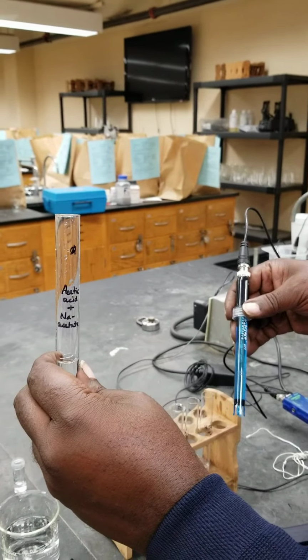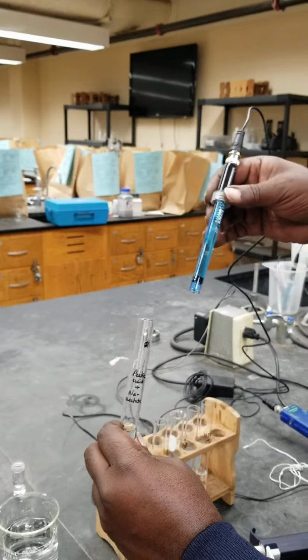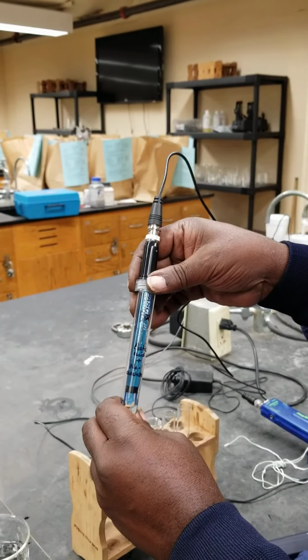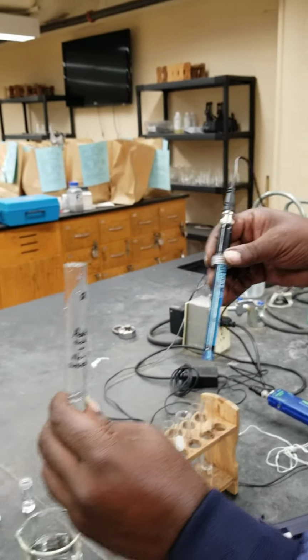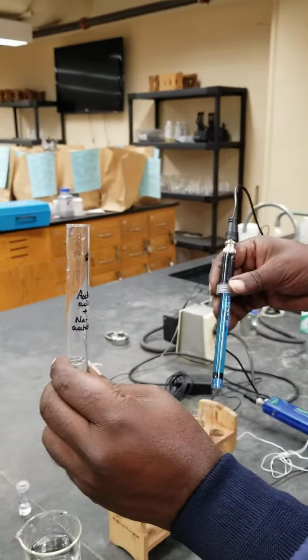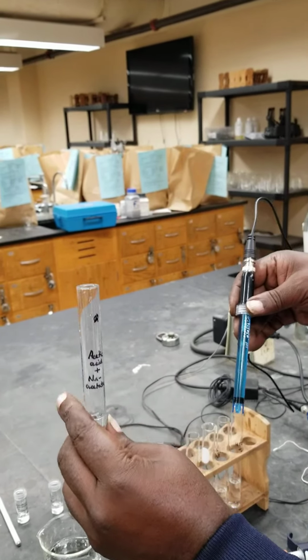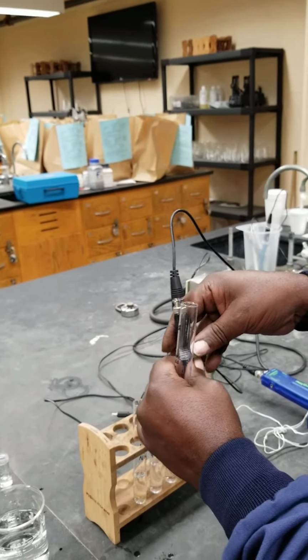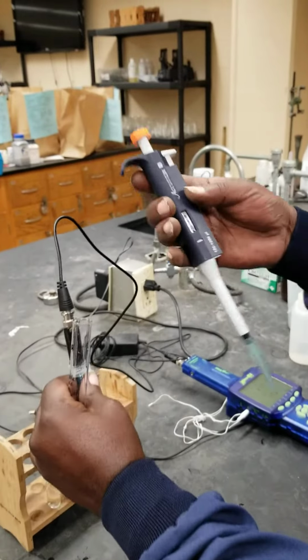And I added about 3 milliliters of water. The volume of water doesn't really matter. The idea is that when I add the base, the electrode should be sufficiently submerged in solution. So right now, there's just the acetic acid, 5.00 milliliters, and the water. I'm now going to add the base. If this is acetic acid, the base is sodium acetate.